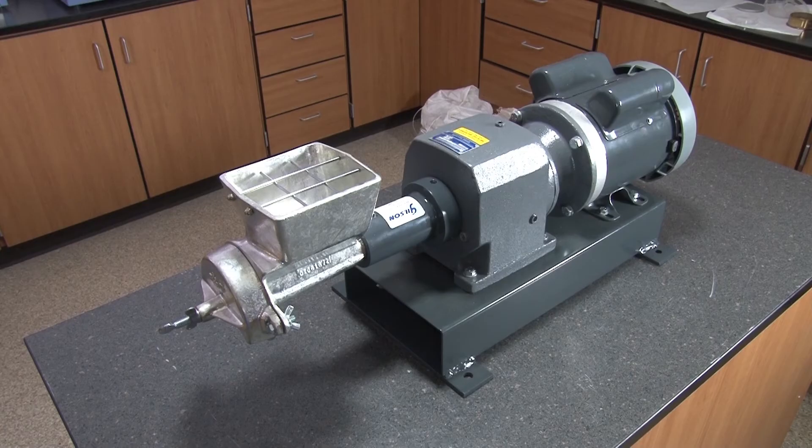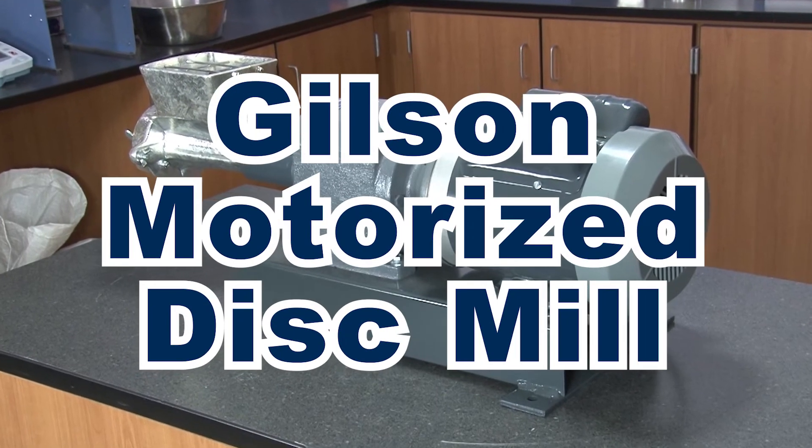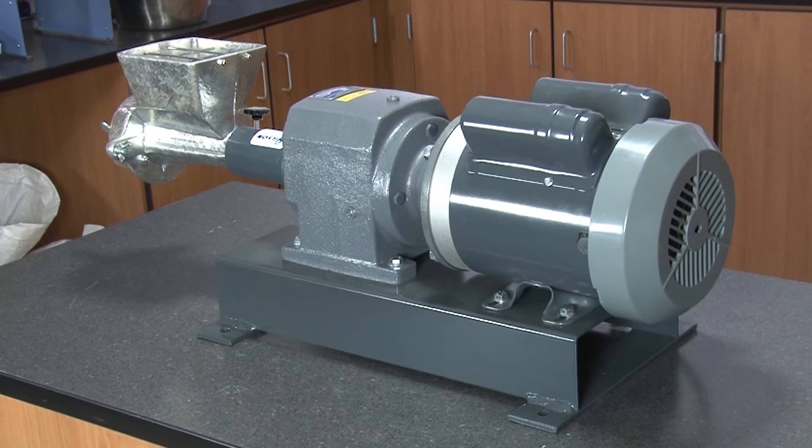All components can be easily reached for cleaning and maintenance, making the Gilson motorized disc mill the right choice for your materials testing lab.